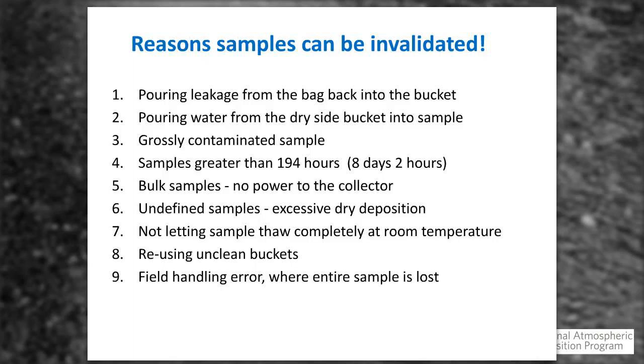If you accidentally drop a lid, or if you actually touch the inside of the bucket, with the amount of chemistry we do, please make note on the bottom of the form, because likely we're going to find it in all of our analysis. So we appreciate the honesty and integrity of the operators to let us know if something like that has occurred.